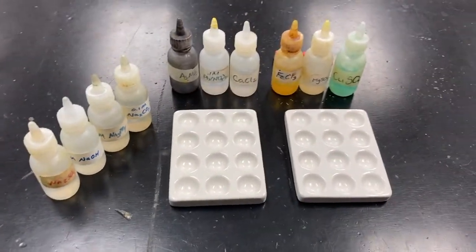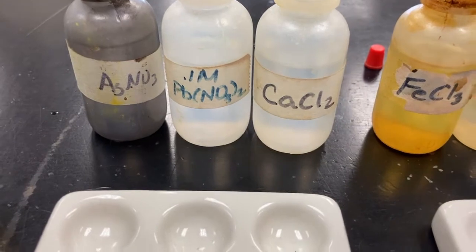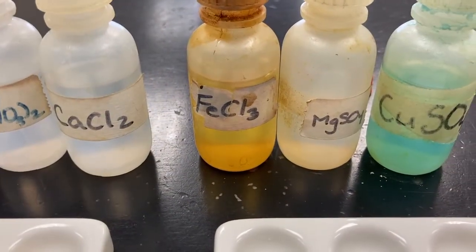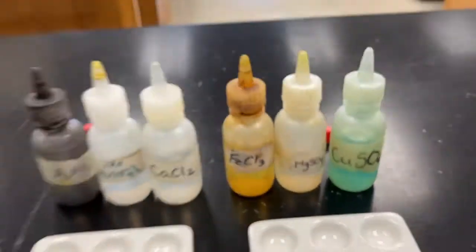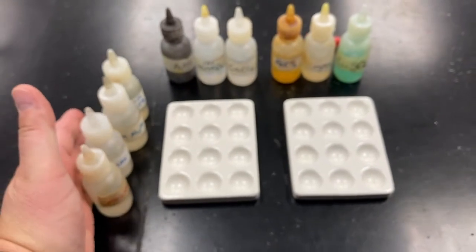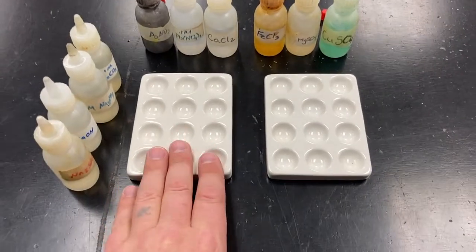And then along the top side here, I have a bunch of different types of solutions: silver nitrate, lead nitrate, calcium chloride, iron chloride, magnesium sulfate, and copper sulfate. Now, if you notice, they make a nice little 6x4 reaction matrix. And these are called well plates.